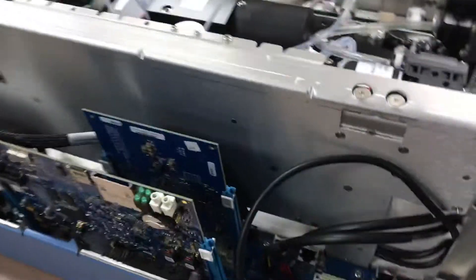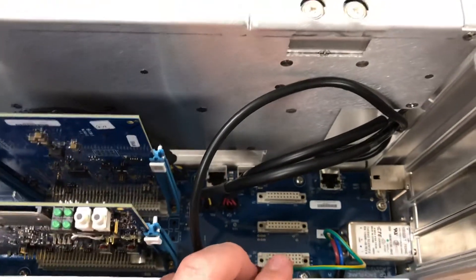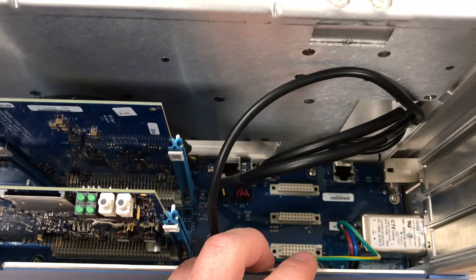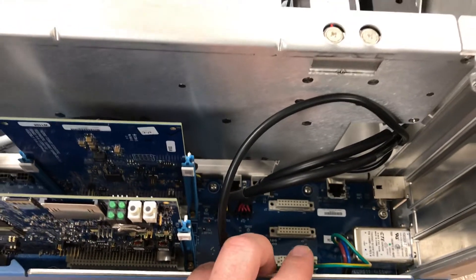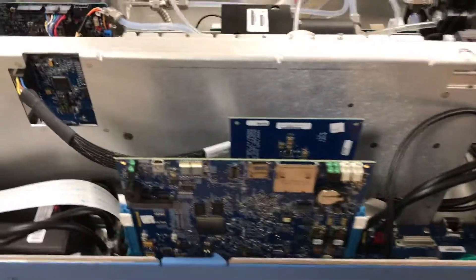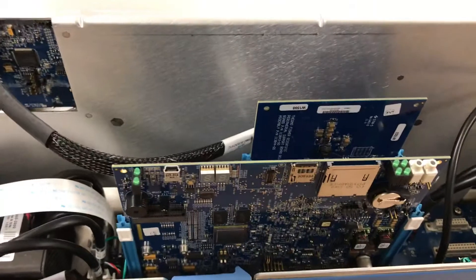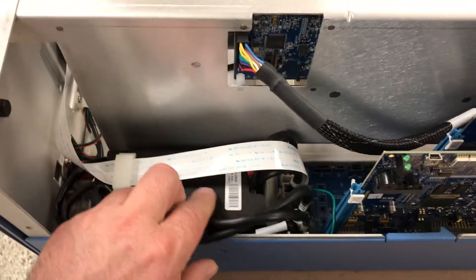Back around this side, you can see the three board connectors where, if you had the options for RS-232, analog output, and digital input, these boards would be populated here. The motherboard has been redesigned — you can see the centralized CPU electronics — and the power supply is a bit different from the I-Series 450i analyzer as well. So a lot of changes on this instrument.